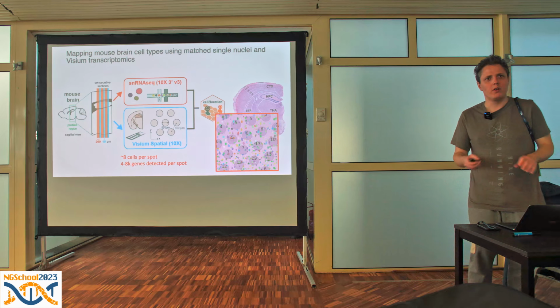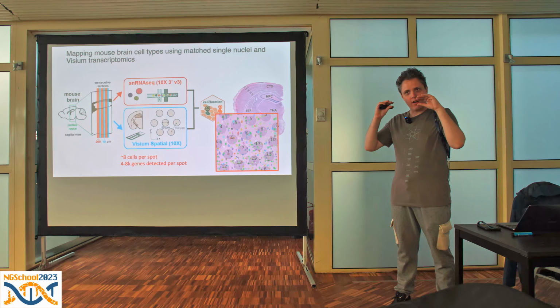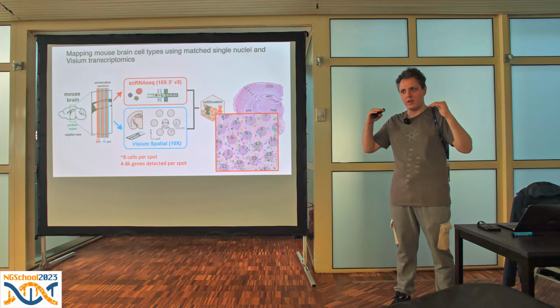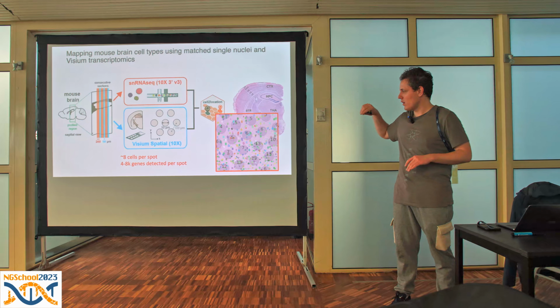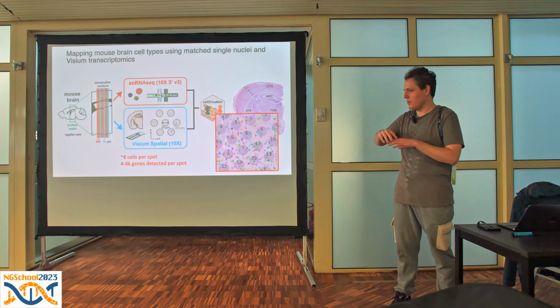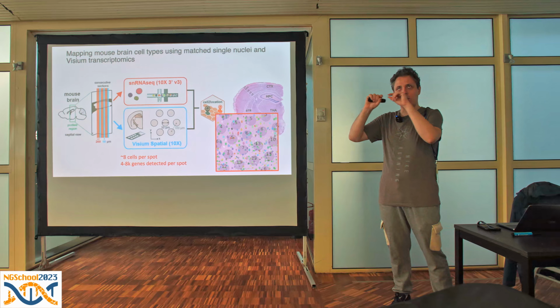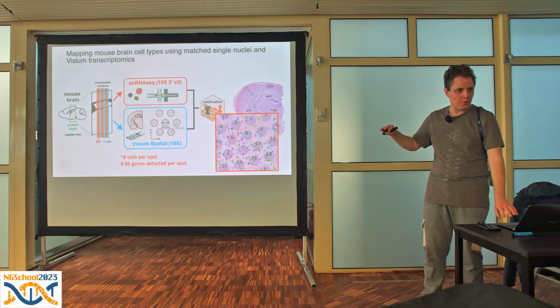And actually, one of the important points that I didn't mention before is that the way these sections are sectioned on cooled microtomes is not perfect. So the section thickness can vary between individual samples, between different people who process the tissue. So there is this additional layer. And an important point is that because this layer is just 10 micron thick, it will capture some cells partially.